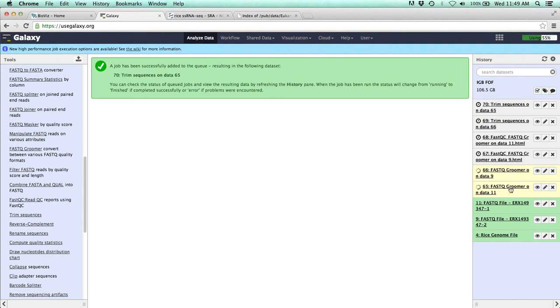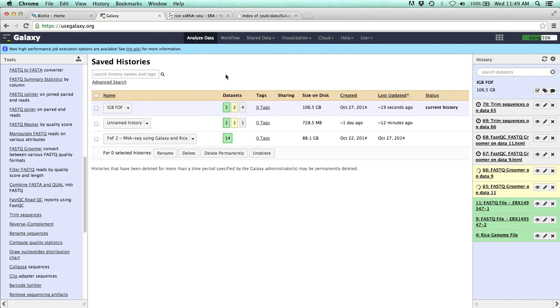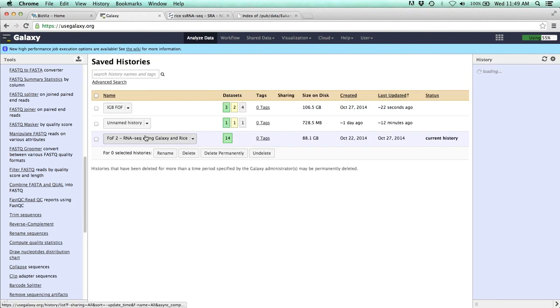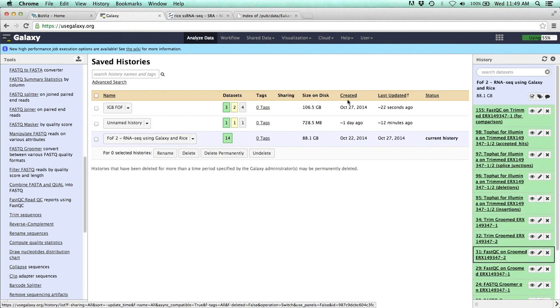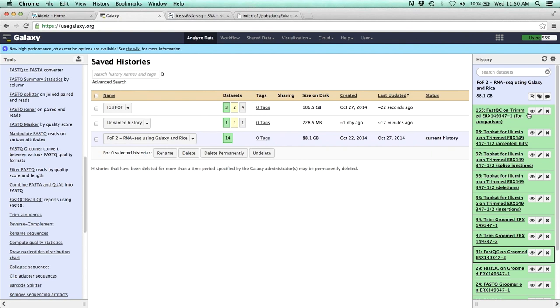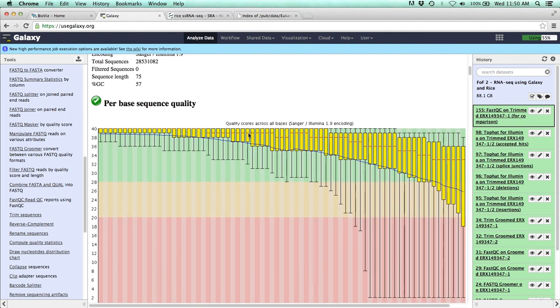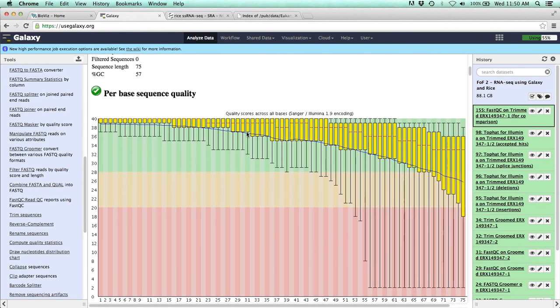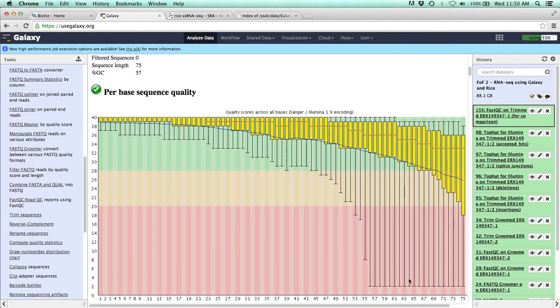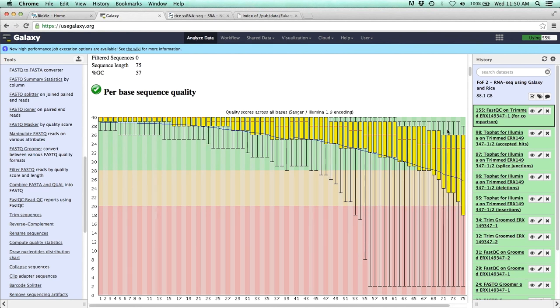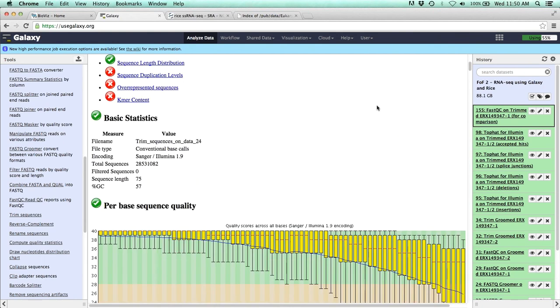So once again, as soon as this groomer is done, then the fast QCN, these trim sequence tools will start running. In the meantime, we can jump back to our saved history, go back to the completed history. And what I thought we could look at would be the fast QC on the trim data and just to see how that changed it. And so you can see is that now instead of ending at 120 base pairs, it ends at 75 base pairs. And we get the green check mark. So it's good. So none of our reads on average are well within kind of the range that they should be in.